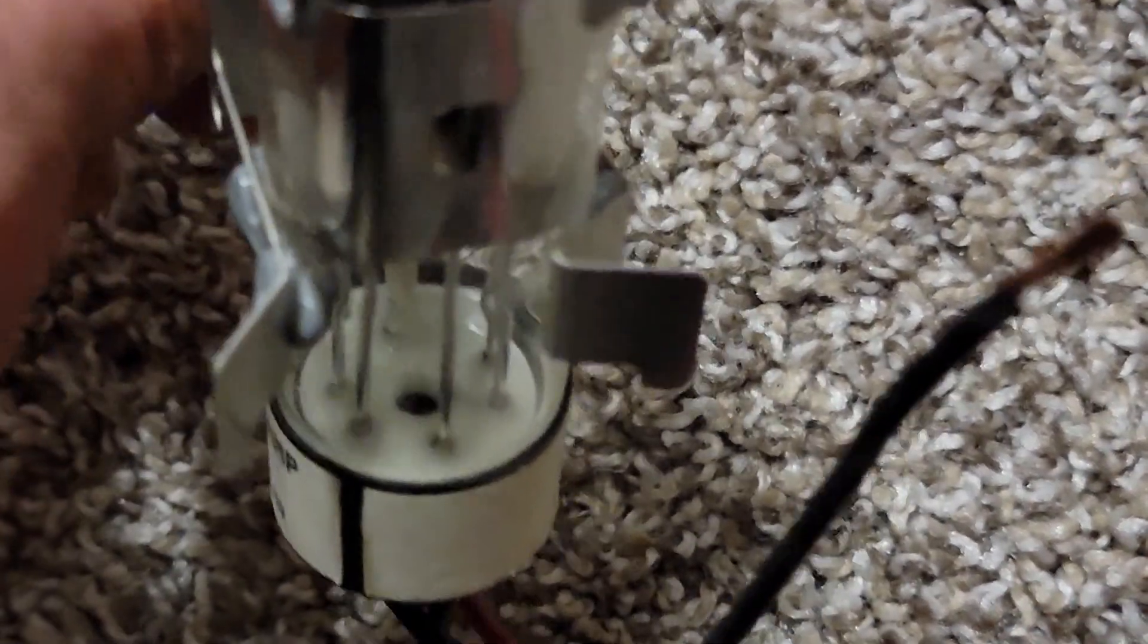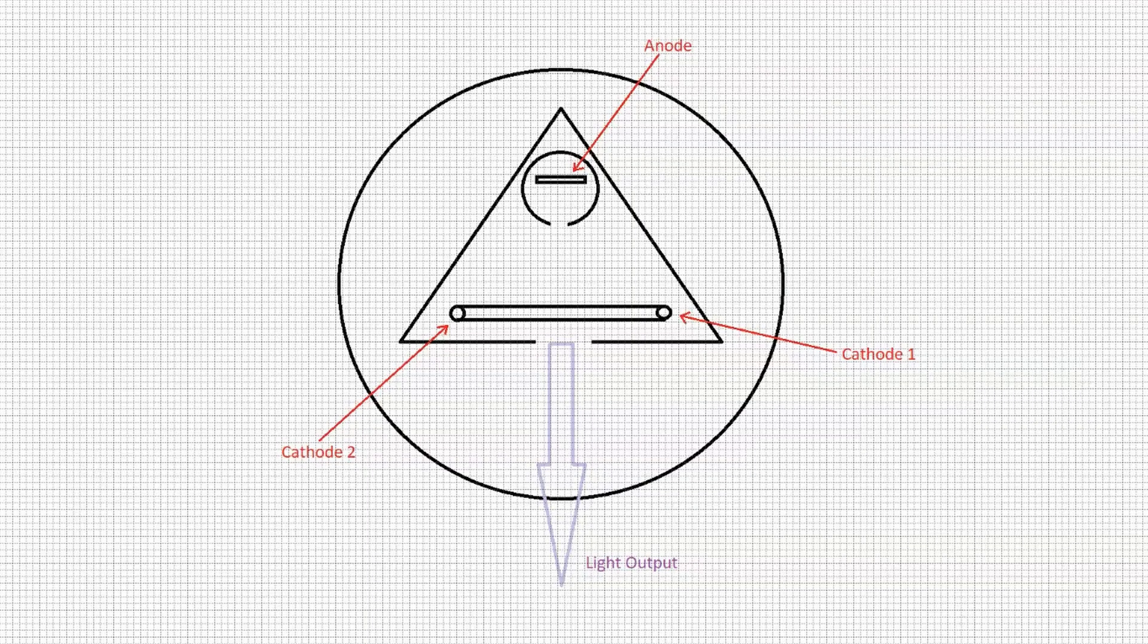Deuterium lamps, like most light-emitting lamps, have an anode and a cathode. These are an arc lamp, so unlike incandescent bulbs, the filament is not the source of light in deuterium lamps. Instead, an arc is created from the cathode filament to the anode.